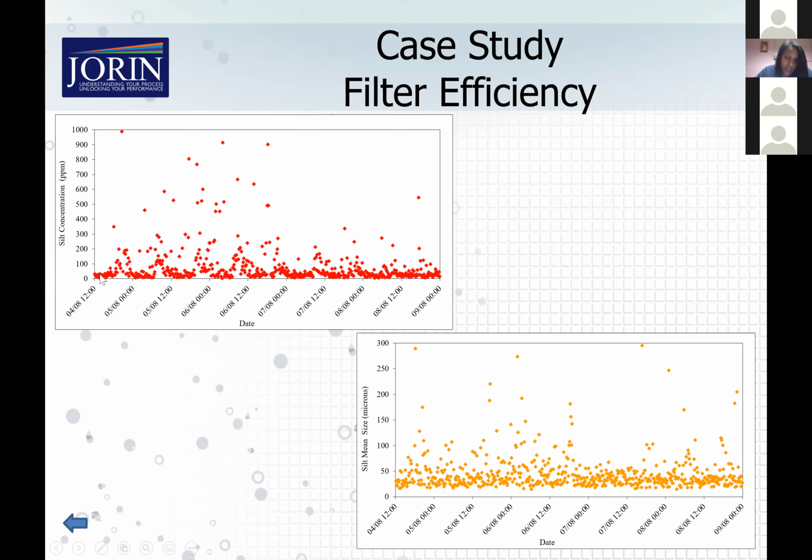And what happens is, because it's actually onshore, very, very close to the beach, you can actually see the effects of the tides in this data. This is, as you can see, over some number of days. And you can see this very cyclical pattern where it goes up and down, goes up and down. That's actually the effects of, as the tide comes in and tide comes out, the amount of silt that gets churned up that comes through the intake goes up and down based on those movements of the tide. So again, it's a matter of looking at how high the loadings go based on when all of those movements are happening. And for 3 or 4 days, there were much higher concentrations here.